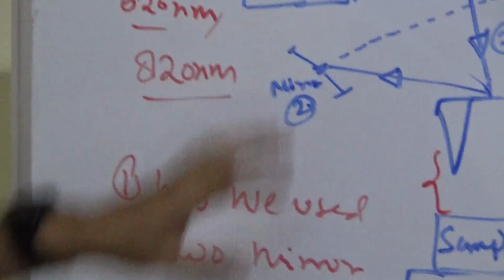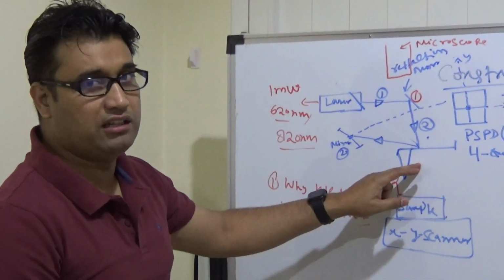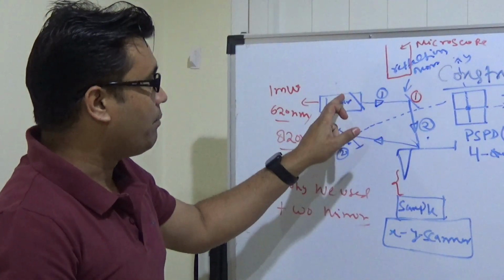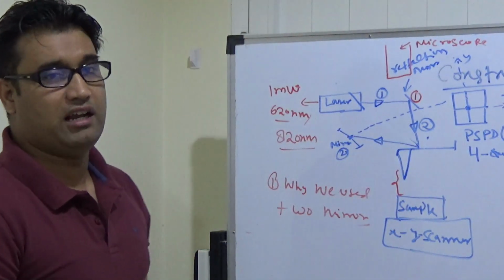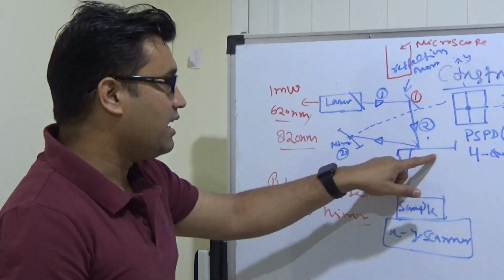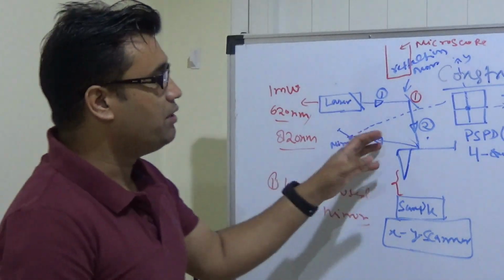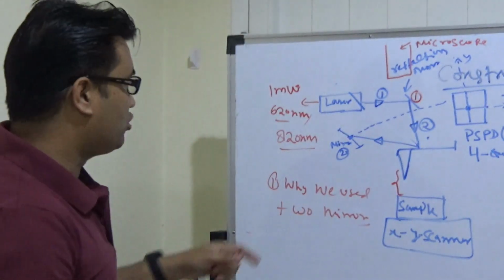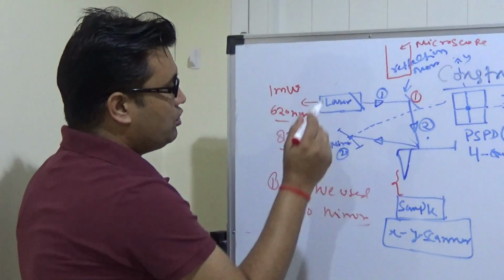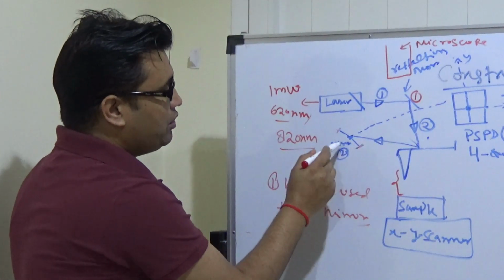What would you do if you hit it straight? There is no direct laser alignment because what is the reason? Directly, if you hit it, you have no option to adjust. So what is the problem? If the lever changes and your hand changes its angle, we will never be able to align it. What is the second question? When we use mirrors here, when we are reflected, why do we use mirror 2? Because with the help of mirror 2, we have to perform.